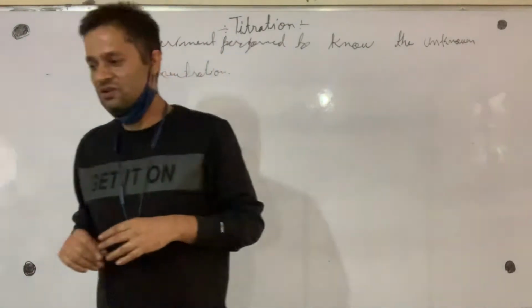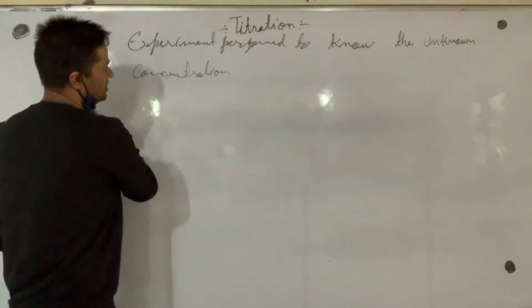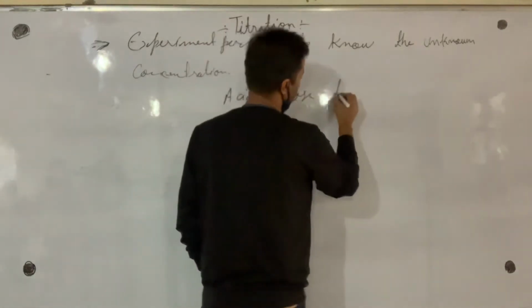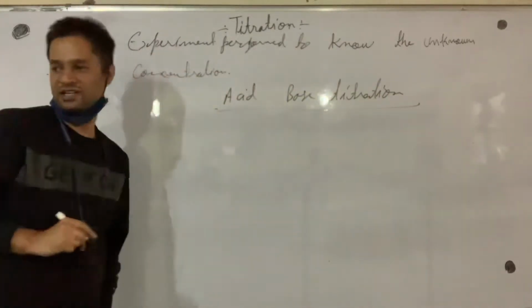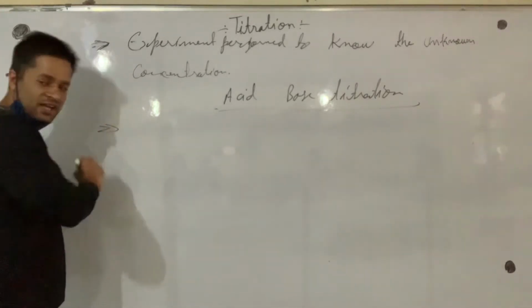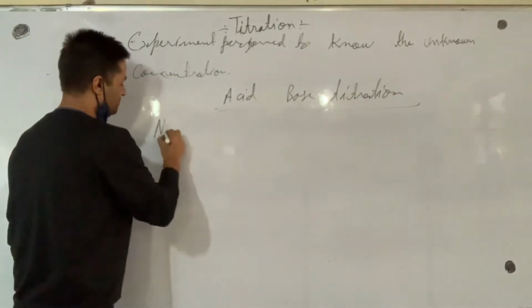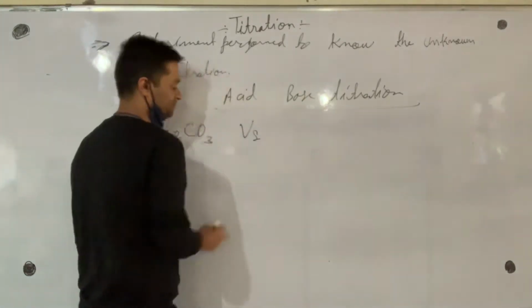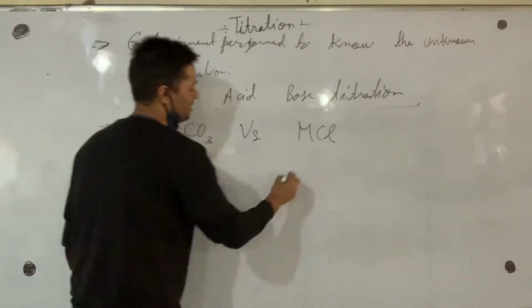Okay? So the titration that we will do is a simple acid-base titration. The titration we do today is sodium carbonate, Na2CO3, versus HCl aqueous, both are solutions.